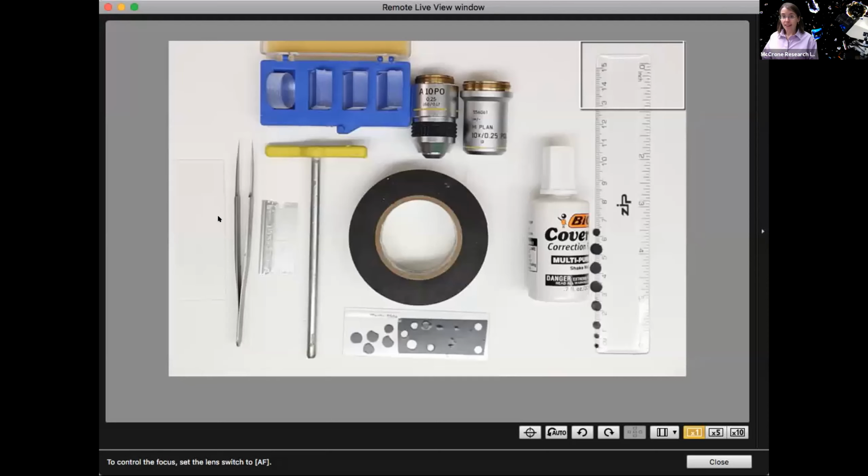I would say that I have seen the occasional factory-made dispersion staining objective where that central stop has been made too small. That means that when you go to close down your condenser aperture, it can't close behind that central stop. And if it's too small, really there's very little that you can do with it.